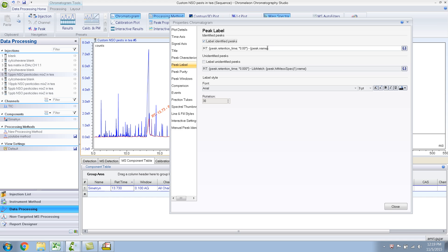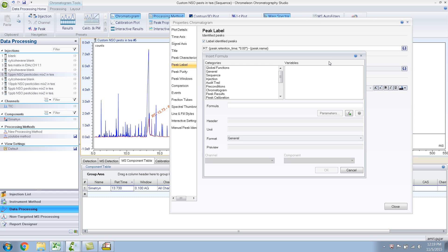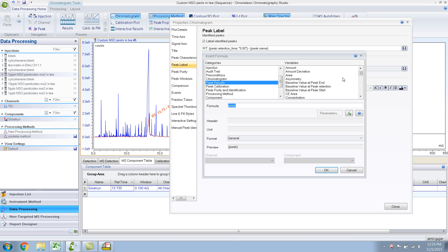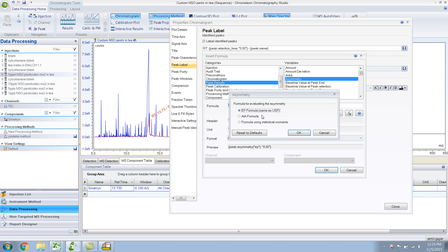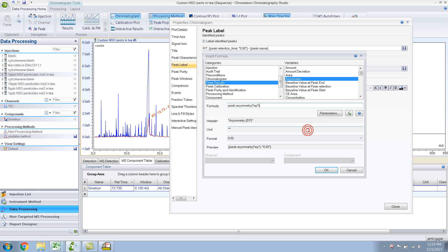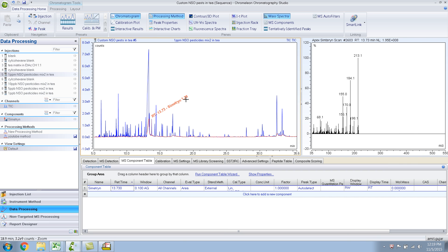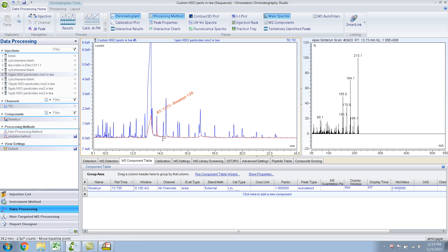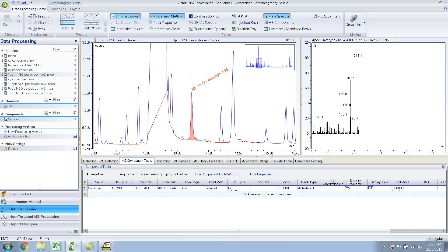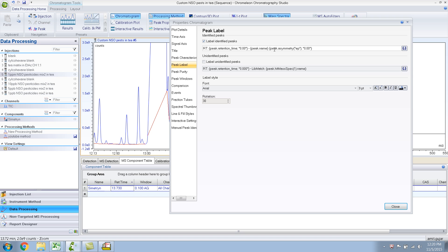Say I want to add something else — for example, the asymmetry of the peak, which shows how Gaussian or non-Gaussian the peak is. You can look at those parameters; this is based on the USP criteria. Click okay and it will show you the asymmetry. So if I close this, it shows the asymmetry of the peak itself — it's 1.26. Anyway, this is just some of the things you can do. Let me delete that because you don't want to see the asymmetry.